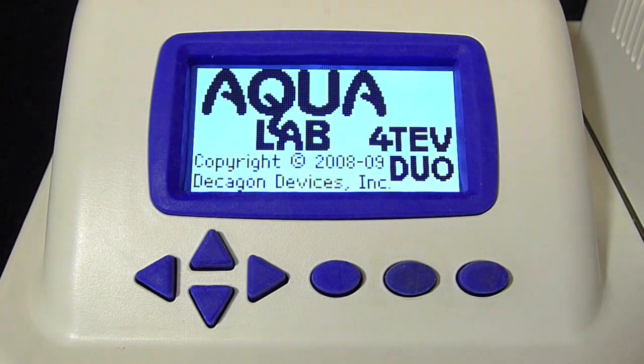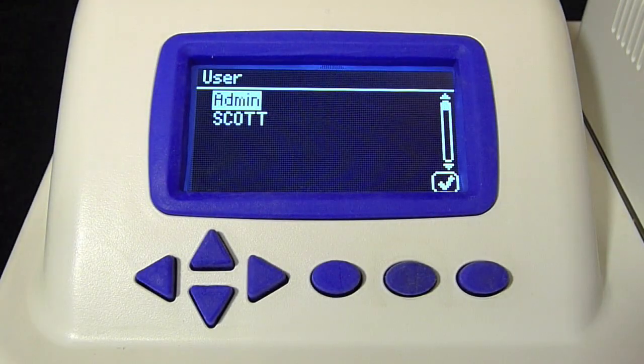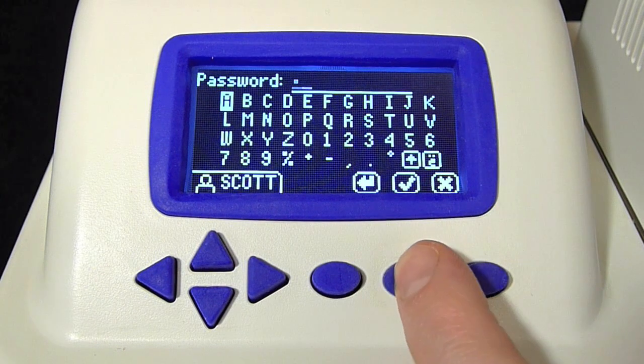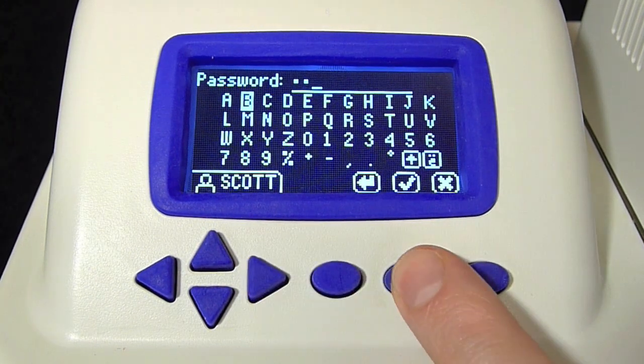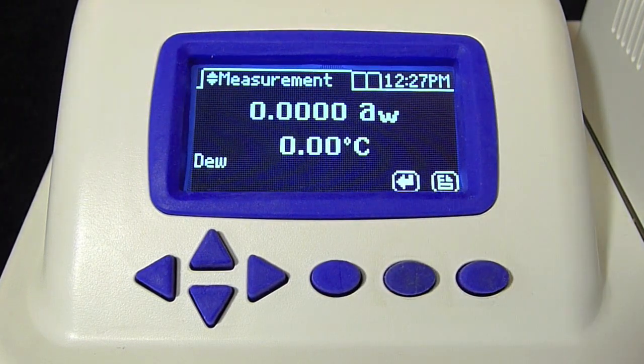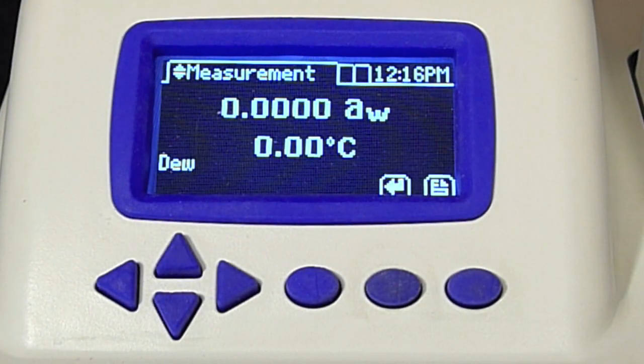The Aqualab logo appears at startup. If user profiles have been set up on your instrument, you'll see a user login screen like this. I'll select my username and login with my password. That will give me access to specific functions and will record that I was the one who made this reading. If user profiles haven't been set up, you won't have to login, and you'll see this screen upon startup.